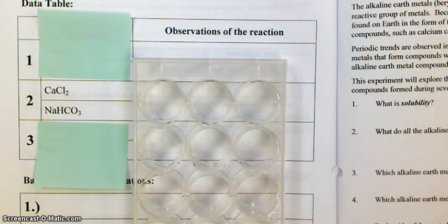All right, the next one I'm actually going to use a clear spot plate, and you're going to see why in just a minute. So right here I'm going to put the calcium chloride, this one. The calcium chloride solution is going to be here. The sodium bicarbonate, NaHCO3 solution will be right here. And then this last well of the spot plate is where we will have them react. Okay, so calcium chloride right here.